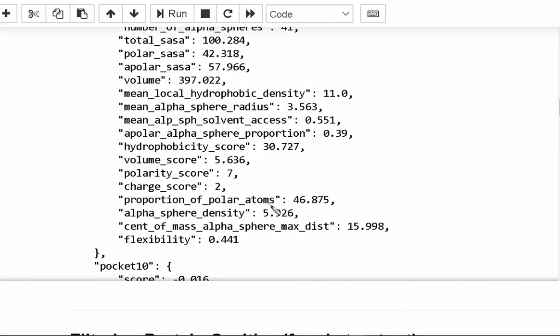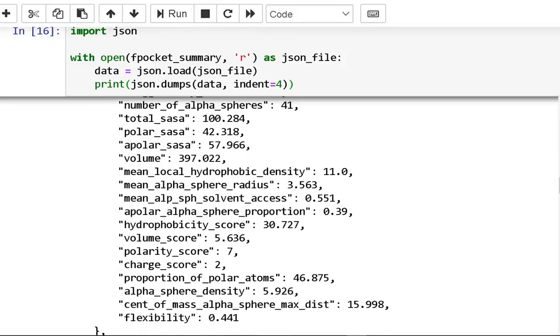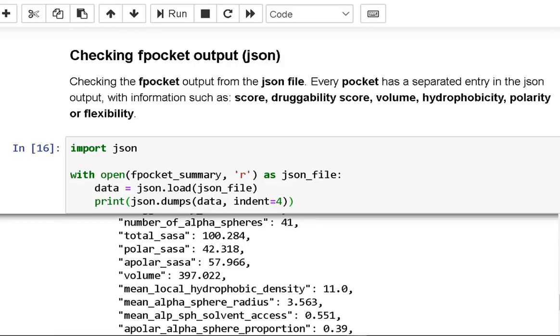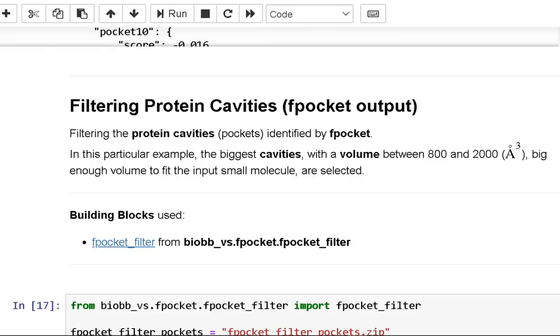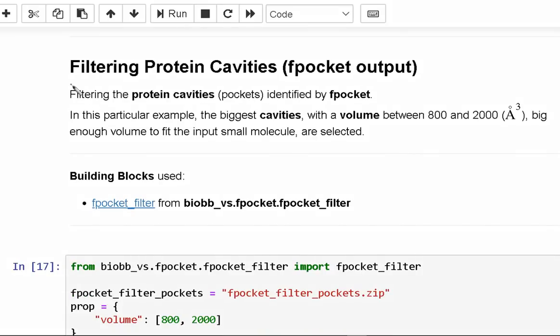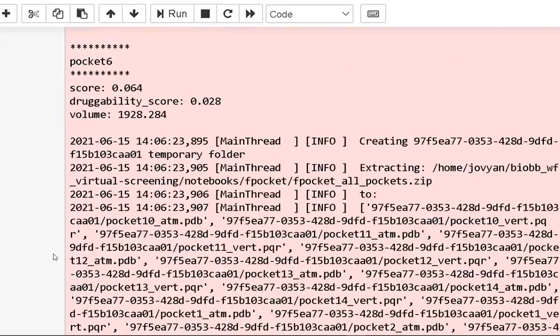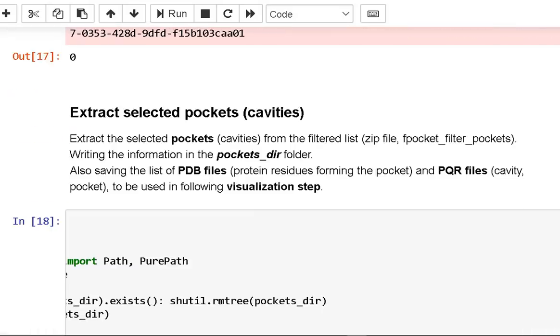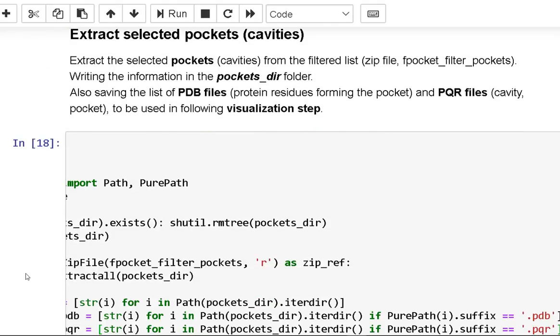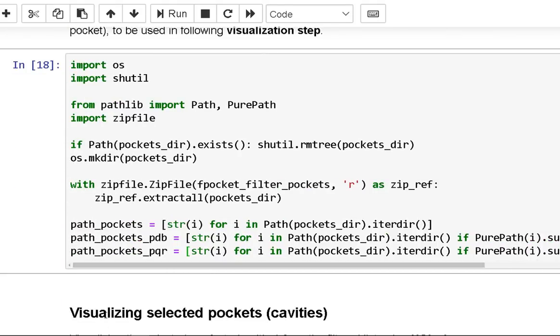In this case, the largest cavities are chosen, with a volume between 800 and 2000 cubic angstroms, which is large enough to fit the input small molecule. After extraction of selected pockets, we write the information in the pockets directory folder. It will also save the PDB files and PQR files.